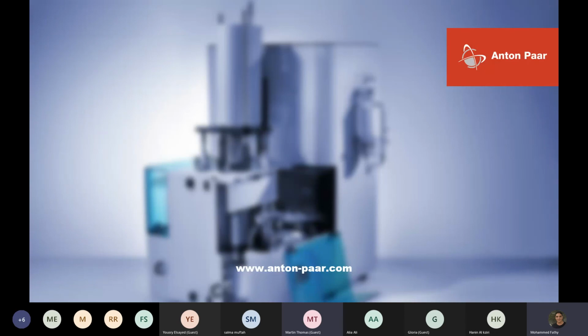Now, the liquid mercury that you separated off originally, that can go back to a recycling company. So there are recycling companies who will gladly take the mercury back. It has a very high scrap value, and they recycle it for you. So we have to make sure that mercury doesn't get into the environment, but it is a concern.